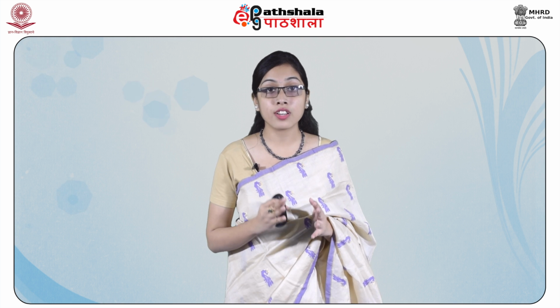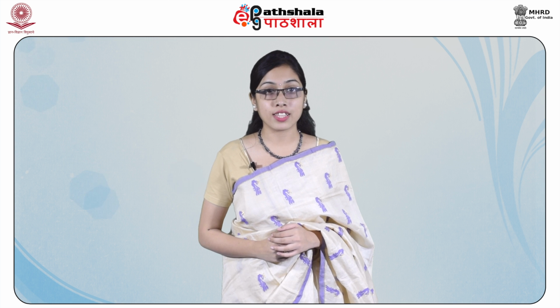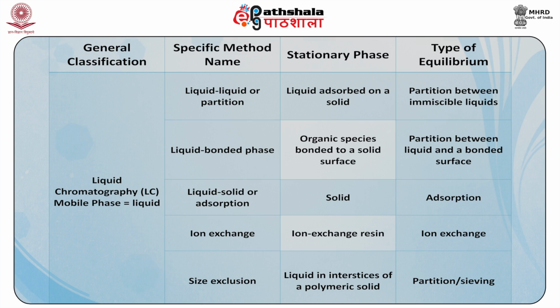The column chromatography types can be further classified, and this classification has been explained in this table, wherein one column has the general classification, the other column shows the specific method name, the third column shows the stationary phase, and the fourth column shows the type of equilibrium. Let us first start with liquid chromatography, where the mobile phase is liquid. There are specific methods under this type.